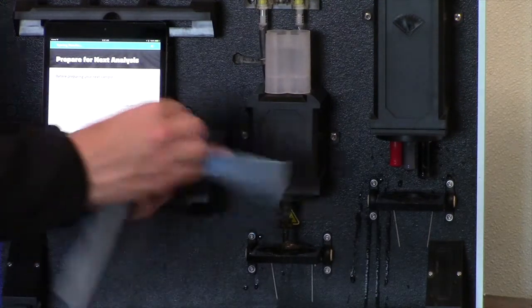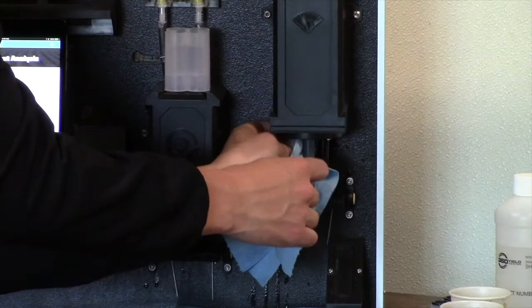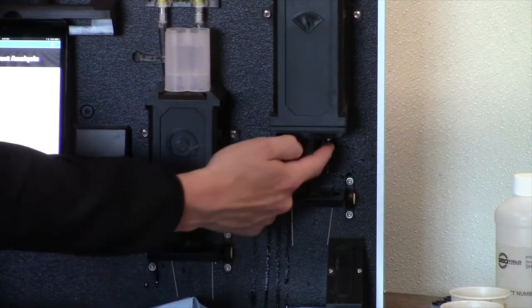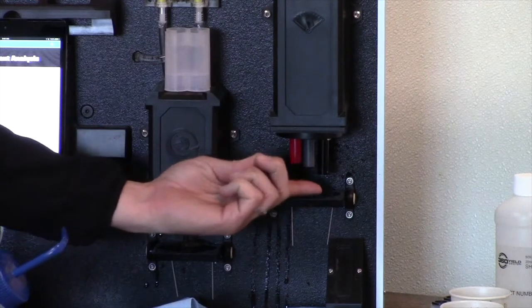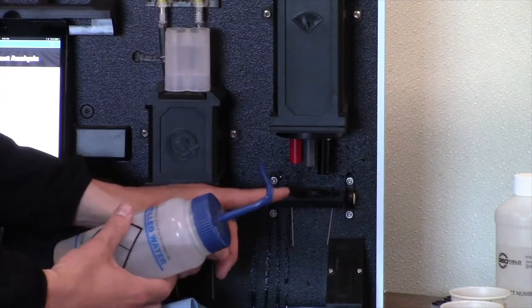We then take a second towel and we start cleaning around the sensor. Know that I can't damage the sides of the tips. But now, after that's done, I see that there's no soil remaining on the outsides of the tips. I then clean the bottom of the sensor, which is where the actual sensor is and where the reading is being taken. So this is the important part.